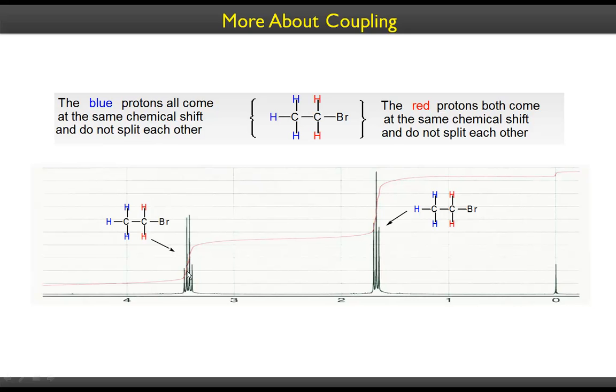The integration also tells something here. This height is in comparison to this one in a 2:3 ratio, so that 2:3 ratio corresponds to 2:1:3 here, right? Remember, the integration is just the ratio.